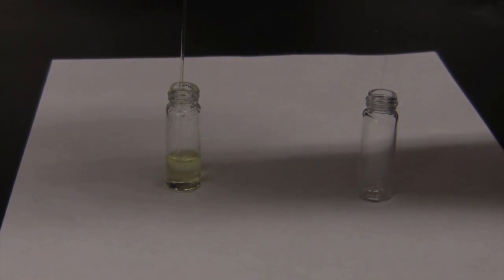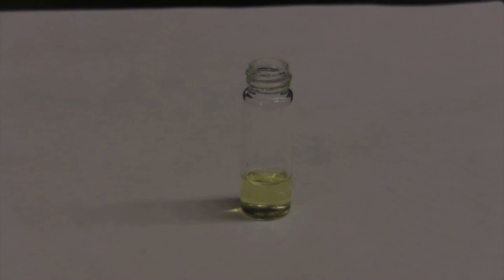The alcohol can then be extracted using an organic solvent.